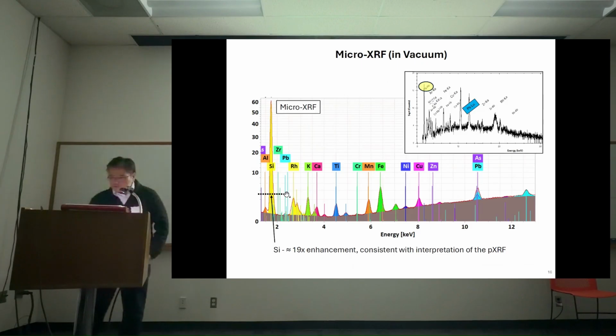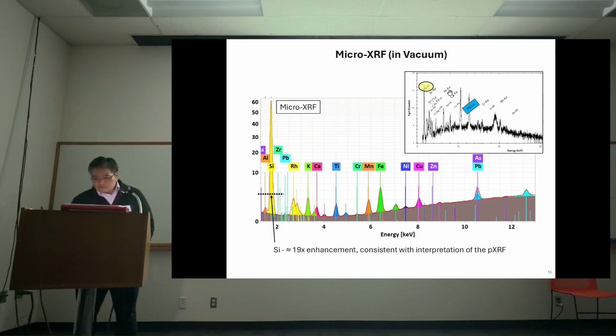What we saw here with lead and silicon being a 1-to-1 ratio in portable XRF, you would assume, is this a lead silicate? No, this is how we get a more accurate 1-to-1 scale of the peaks explained.